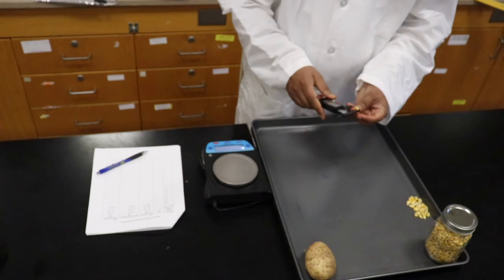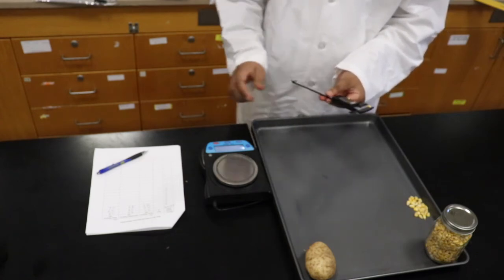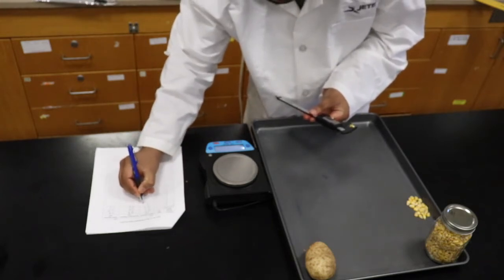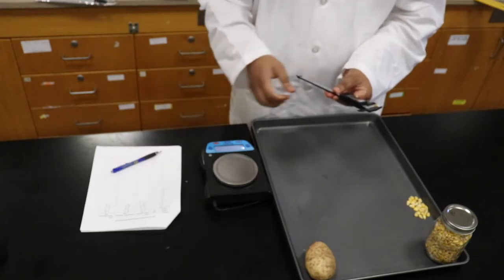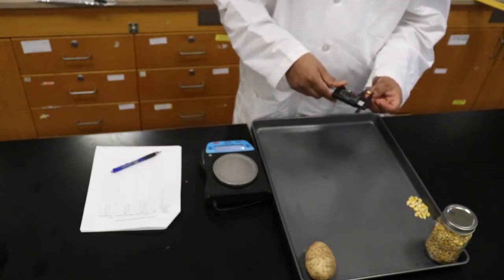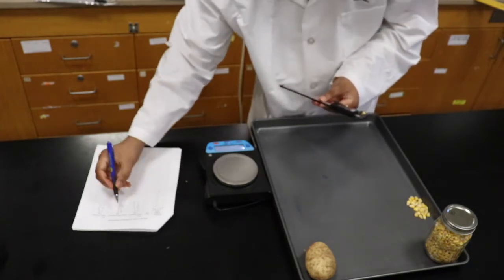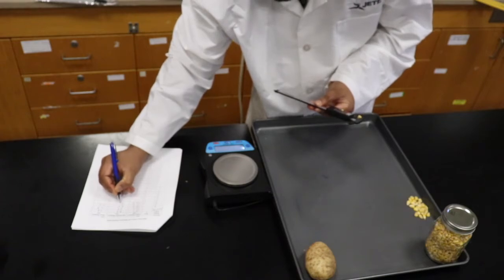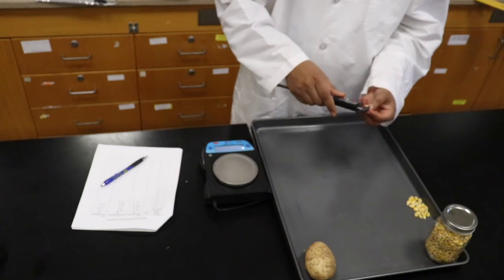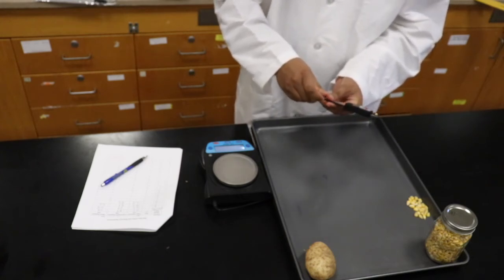Similarly, measure the major diameter and then record the number. Measure the intermediate diameter. Record the number. Measure the minor diameter and record the number.